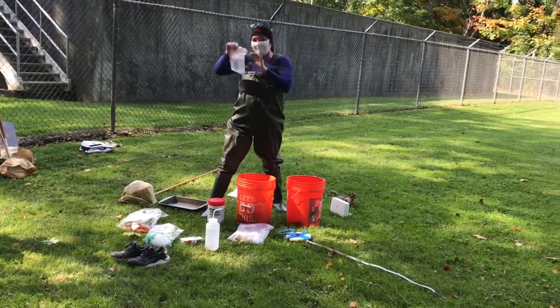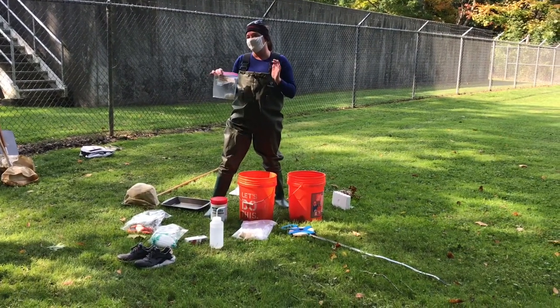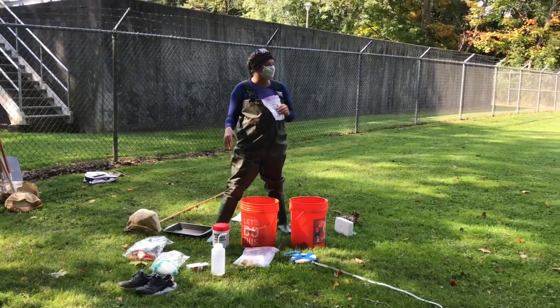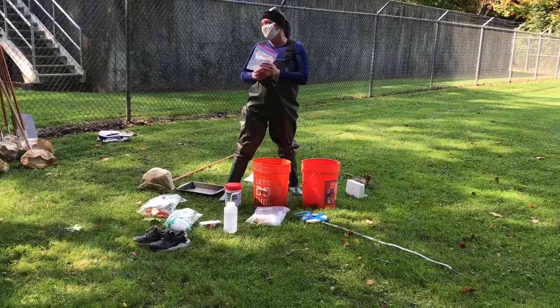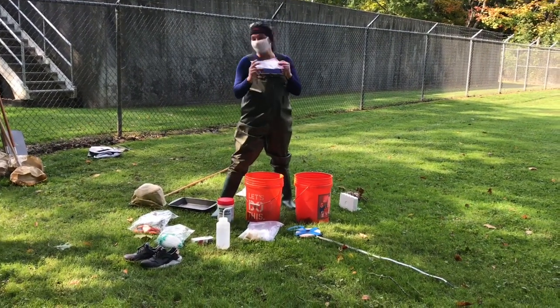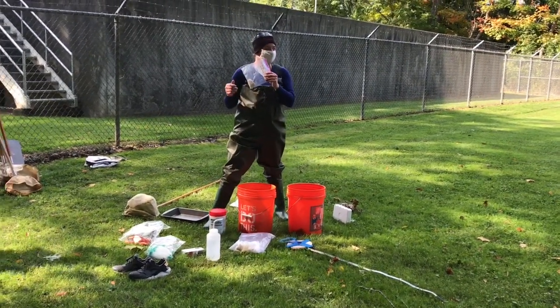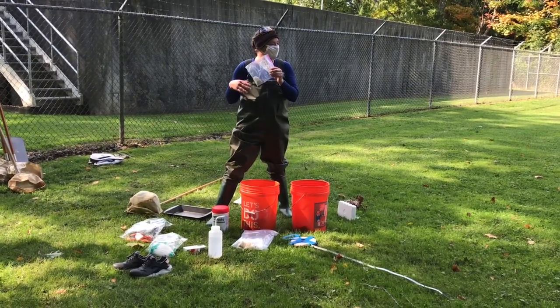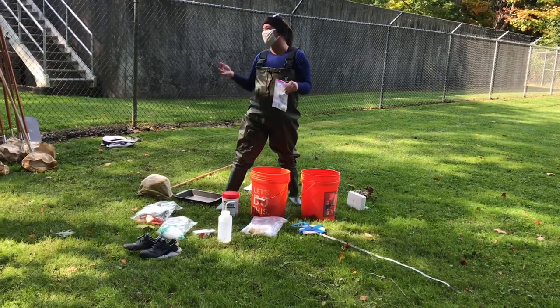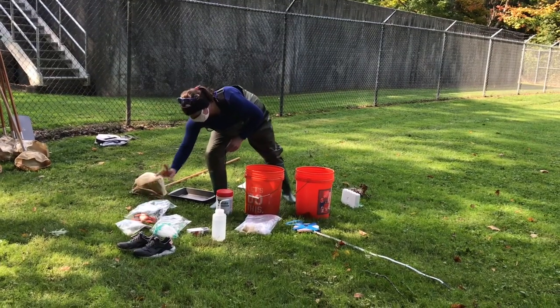Okay. I also have some tags for inside of the vials. So I always double mark my samples. What can happen is that when ethanol gets on Sharpie, it runs. But what can also happen, so this is right in the rain paper, you want to use pencil on this. Put your name and your PM lab on it. But sometimes the interior labels get abrasion, and that rubs off what you've written. So what I found is if I double up my efforts, one or the two always seems to work out just fine. So there are labels there to put inside of your vials.